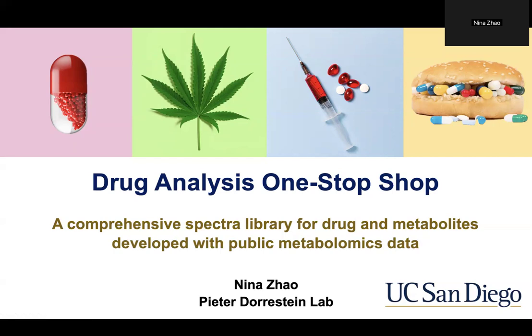Today, I'm going to introduce to you a resource that allows us to comprehensively screen for drugs and drug metabolites in untargeted metabolomics datasets. This resource was developed through support from the mPrint Consortium as well as other funding sources. So I would like to give an acknowledgement to mPrint at the beginning of my presentation.